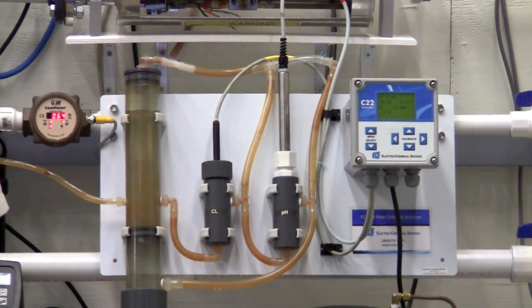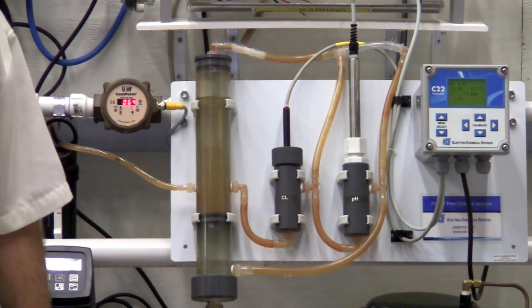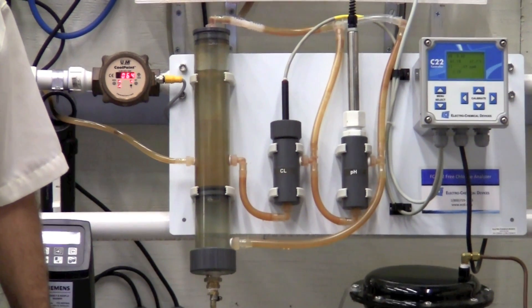For easy start-up, the chlorine sensors are all pre-calibrated at the factory. They're ready to use upon installation.